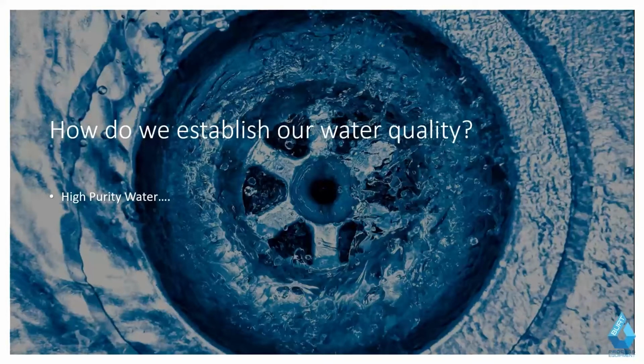So when looking at any kind of a high purity water system, if you're starting out on some kind of a lab-based project or case study as we are in this case, there's two things you have to understand. The first is what is the water quality that you need, and the second thing is how much water do you actually need to use or generate in those cases.